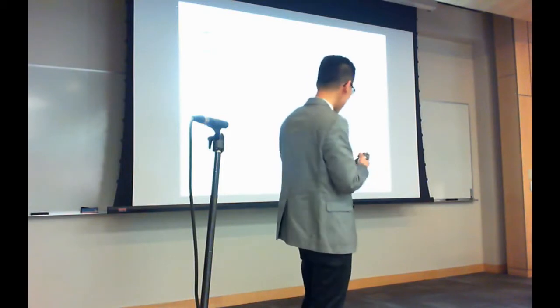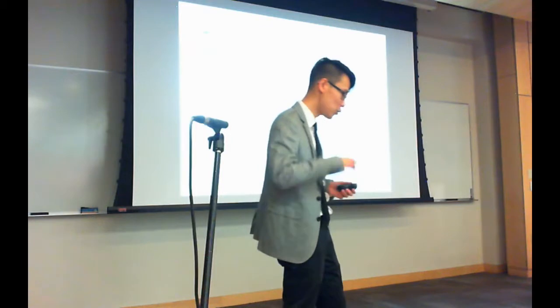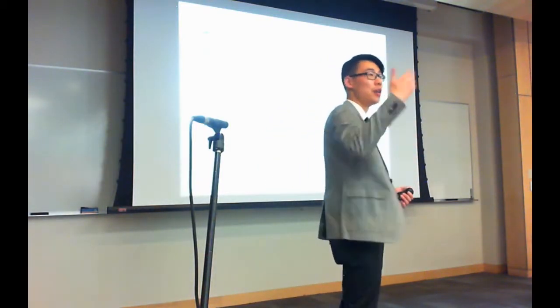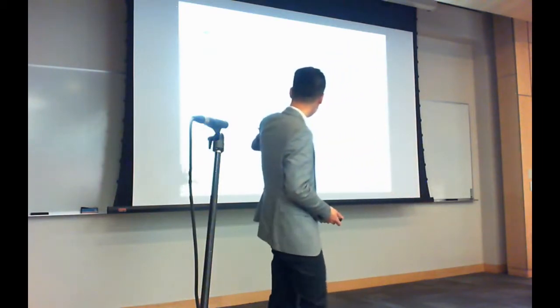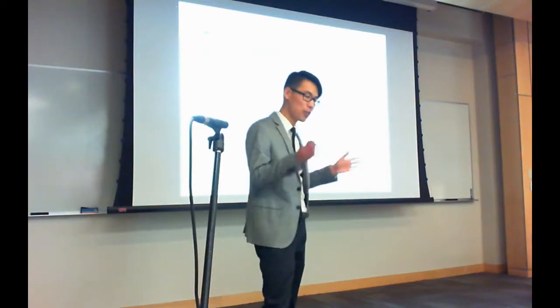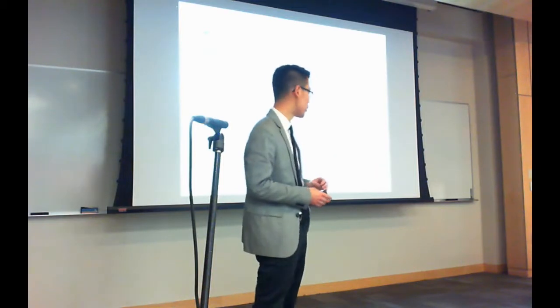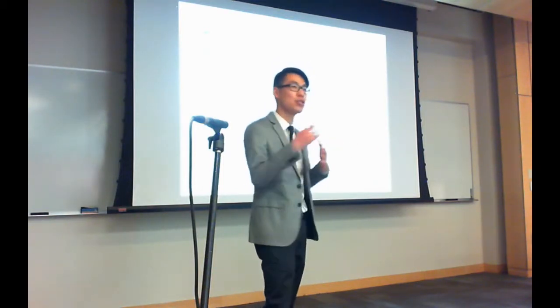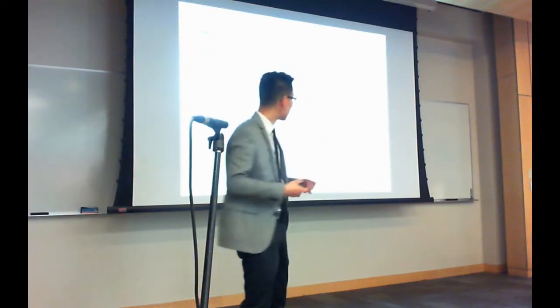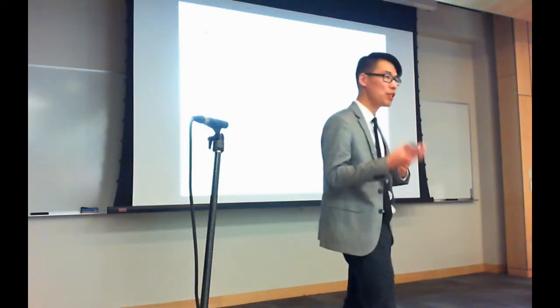But that might not be the best, because we think downstream we want to identify unknown spectra, and so we feel that choosing the most similar to all spectra will best aid in that. And whenever we compare these two strategies of choosing the best score versus choosing the most similar, we find that this distribution in yellow here is the score distribution between our gold standard and choosing the best score. But if we choose the most similar, we actually improve slightly on that.